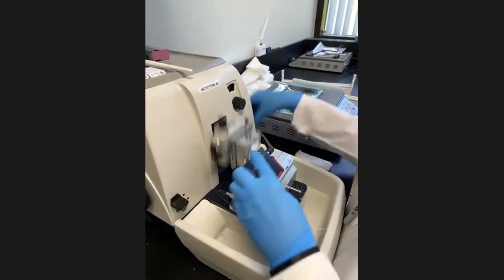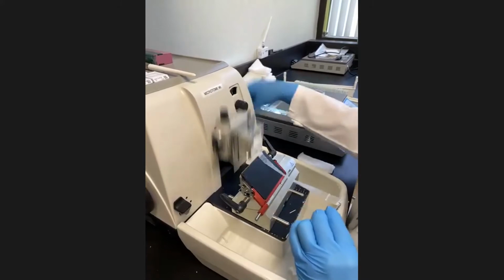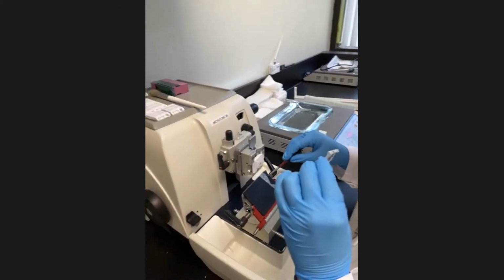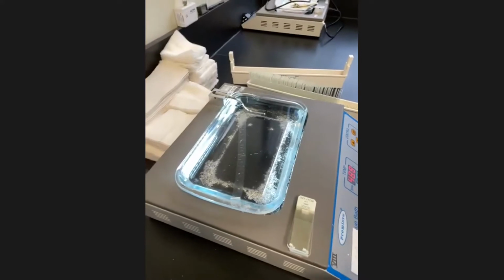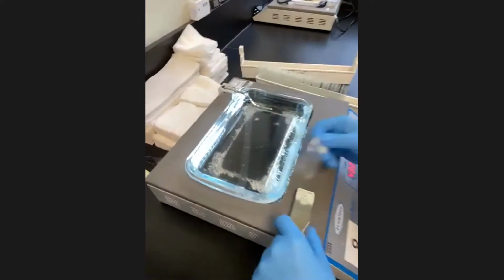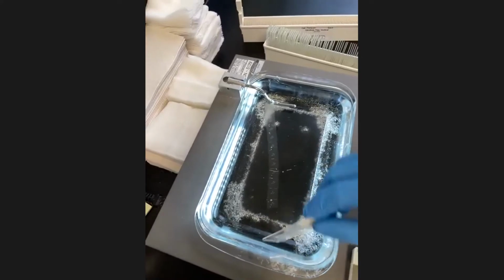I'm facing off the block right now so that I can see the face of the tissue, and you might be able to see it slowly start to come in. So this is what we call a paraffin ribbon. And I'm just going to be very careful, and voila. We're looking for tissue without any wrinkles and folds, and we will then separate the tissue and mount it on the slide just like that.